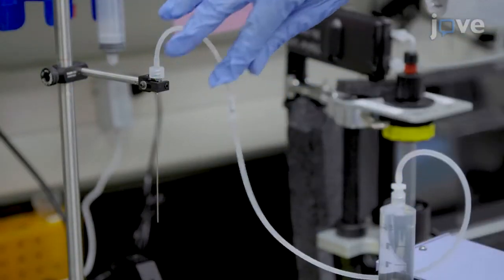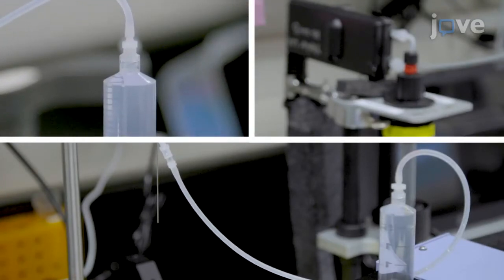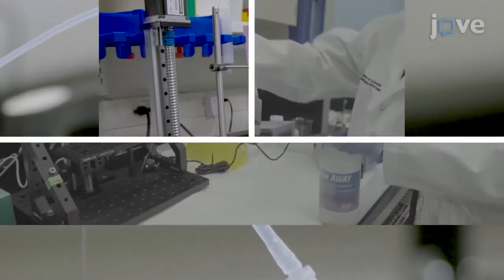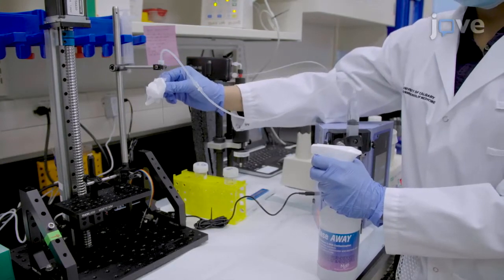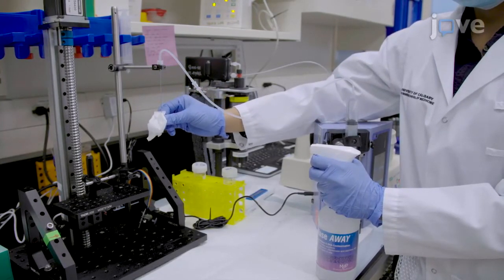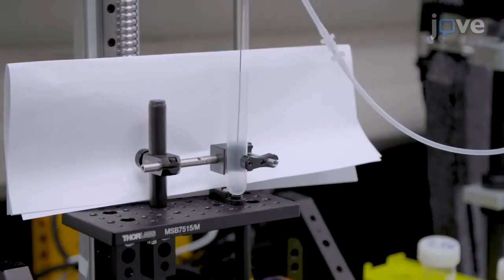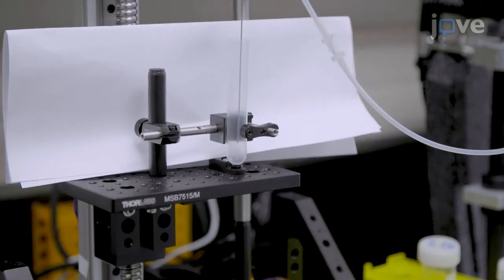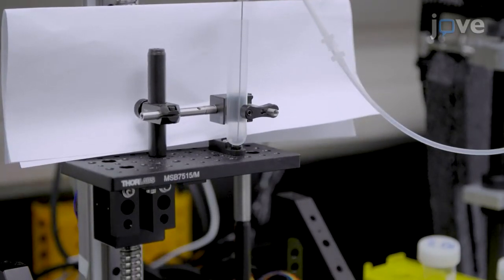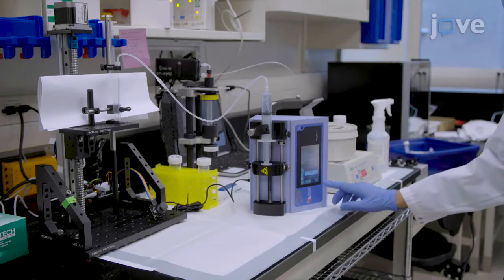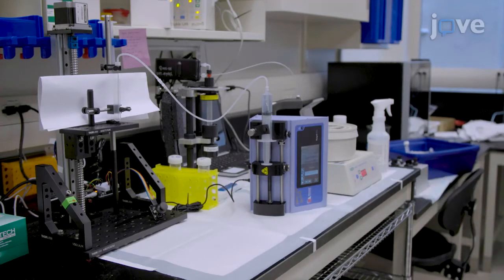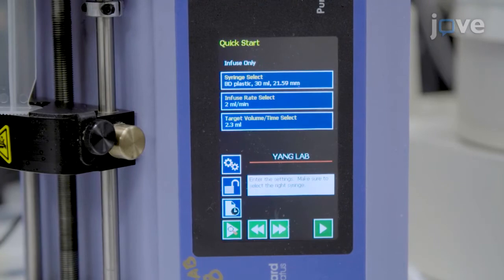Make sure that there are no air bubbles in the syringe, tubing, or needle, and wipe the tip of the needle to remove any residual solution. Move the motorized stage up such that the tip of the needle touches the center of the tube at the bottom. Set the syringe pump to a flow rate of 2ml per minute for a volume of 2.3ml.